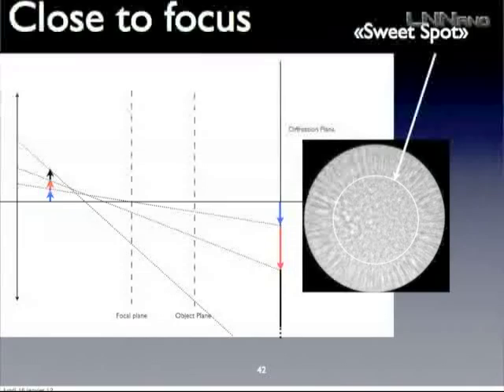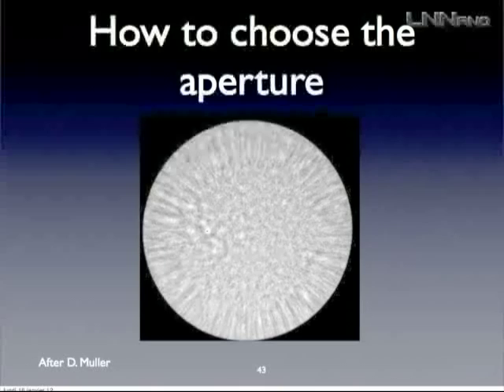The place where aberrations do not arise is sometimes coined the sweet spot. And this is, of course, with this angular part of the beam that you will make your probe. Okay, and that's the most important slide on the Ronchigram. You can maybe even forget everything else of what I said. The Ronchigram is really the place where you may want to correct your aberration.